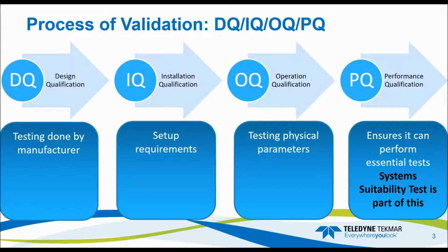We do a ton of analytical testing, including range testing, minimum detection limit testing, longevity testing, so how long that calibration curve will stay in calibration, precision and accuracy, and then we do different types of carbon compound testing analytically. We also do a lot of longevity testing of our parts to see how long we can run them until they fail. So we'll run a pumper, simulate 10 years of use, that kind of thing. So that's all part of the DQ part. You guys don't have to worry about that.